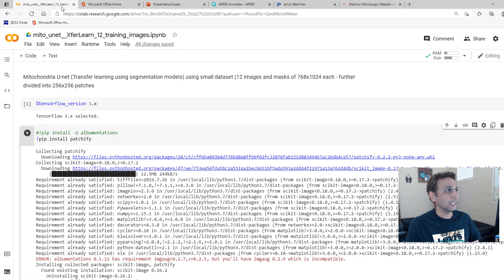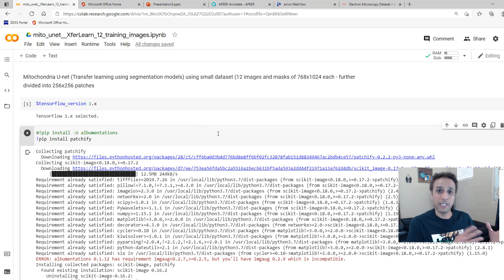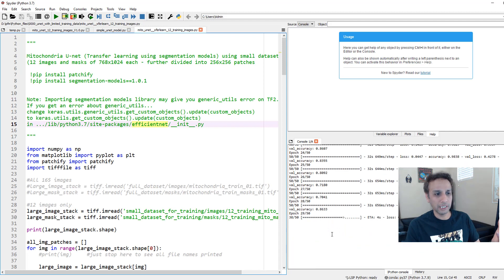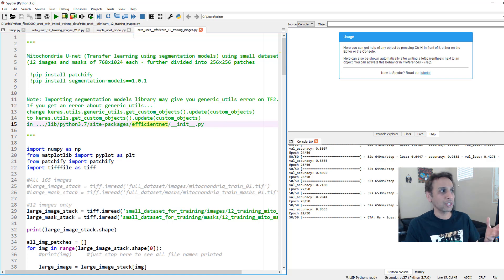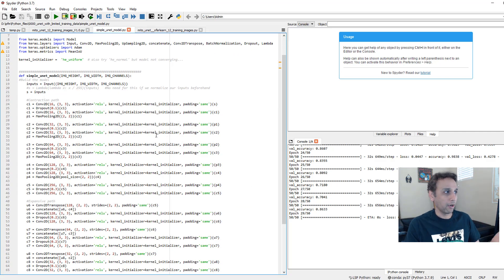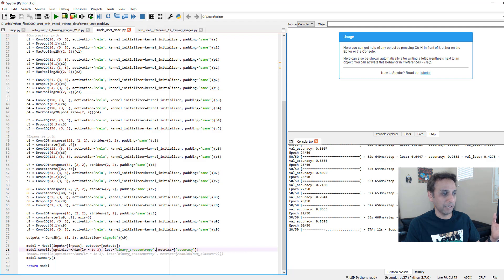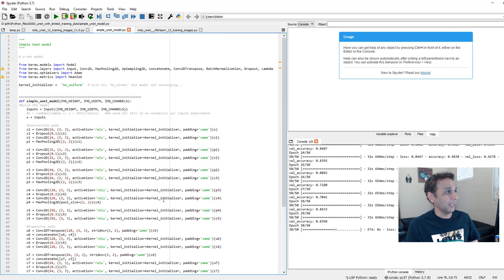Now let's jump into the code. I'm doing a couple of things — this training is done on Google Colab. I've trained a pre-trained model which is a ResNet 34 that has been trained on ImageNet, so it has pre-trained weights. I was also curious to compare that against something trained from scratch — a regular standard U-Net with a regular encoder and decoder, not pre-trained, trained from scratch using binary cross-entropy as the loss function, Adam as the optimizer, and accuracy as our metric.